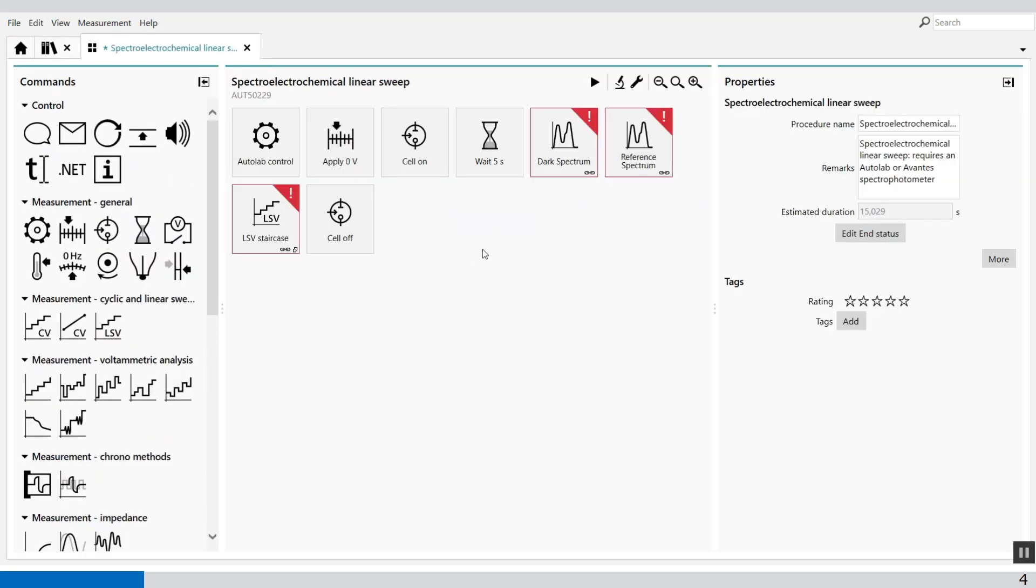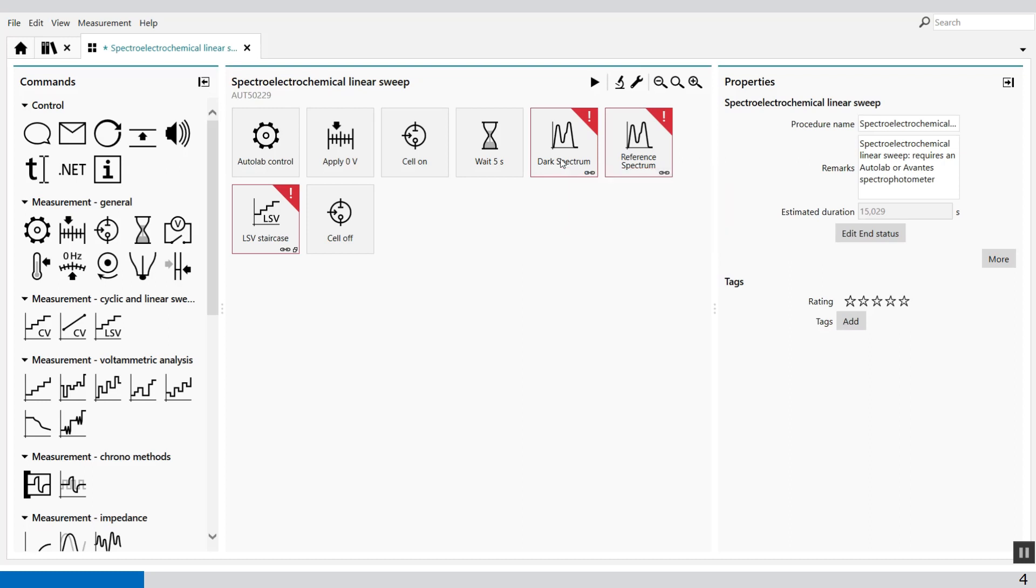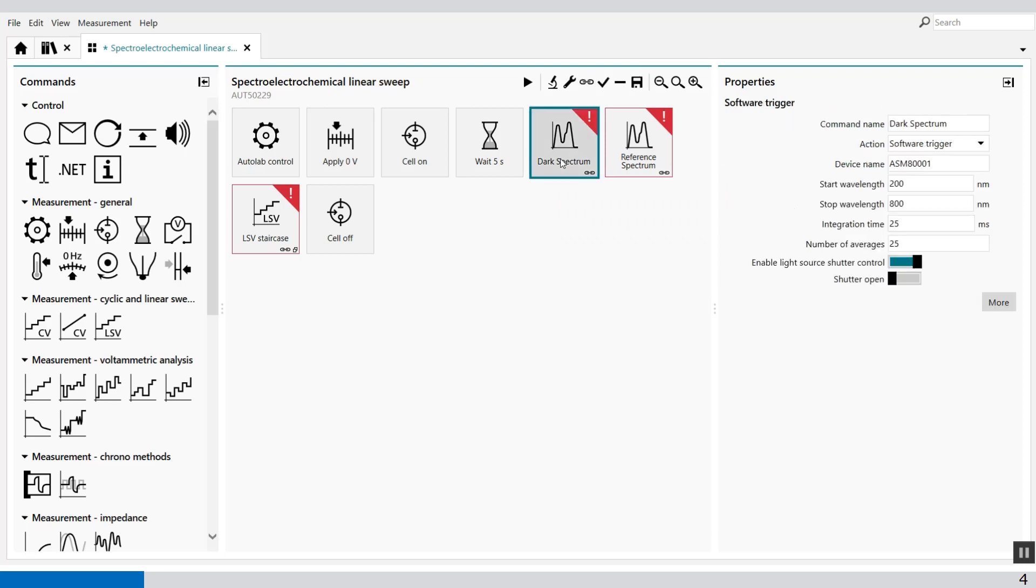It gives you some errors because of the device which is connected now is different than the one which is programmed. So for example, this device name is now ASM80001 and I'm using 80002.